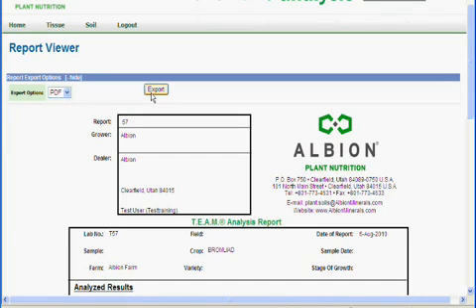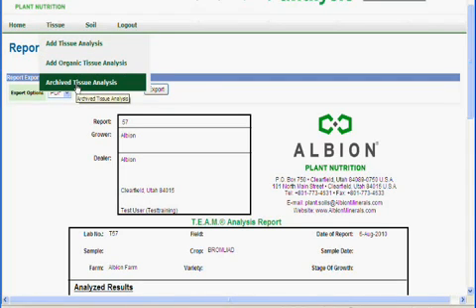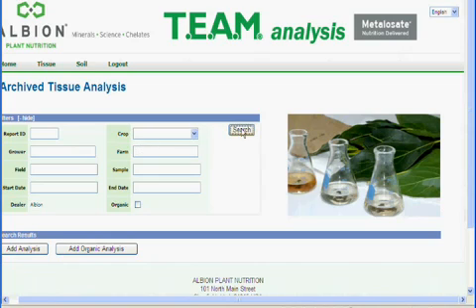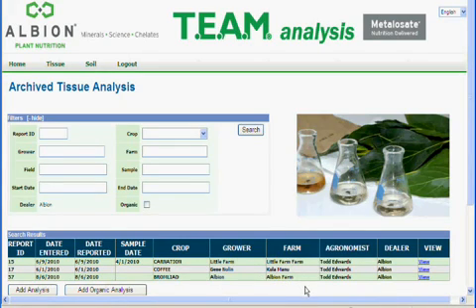Third, the recommendation can be exported in a rich text file or .rtf file. These files are flexible and can interface with other applications for data manipulation such as spreadsheets. If you have entered multiple reports and would like to view the recommendation reports, click on Archive Tissue Analysis. The archived analyses are logged on this page and can be viewed by selecting Search.